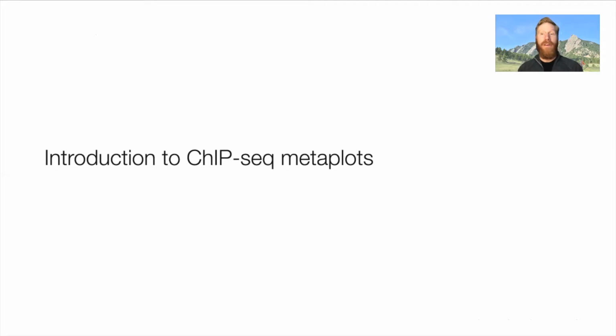Hello, in today's class, we're going to be talking about an introduction to ChIP-seq metaplots. We'll do this in two parts. First, we'll go through conceptually how to create a metaplot and what a metaplot is in this presentation. And then we'll go to RStudio and actually create some metaplots using the data that we've run through Nextflow.